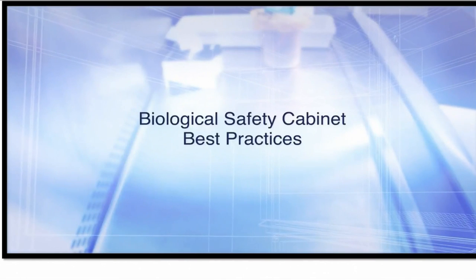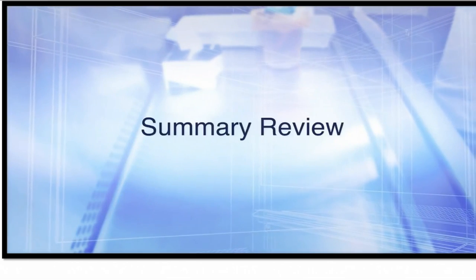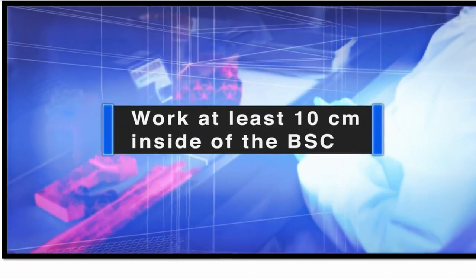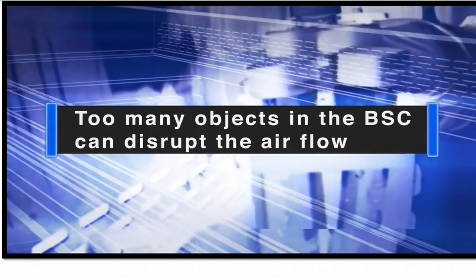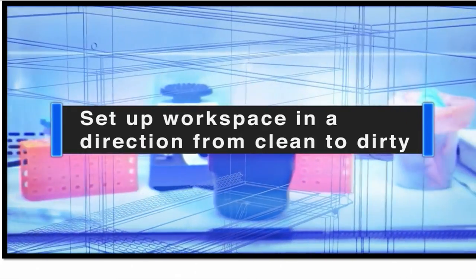In summary, there are a small number of best practices to follow in using a biological safety cabinet. Let's go over them one last time. Work at least 10 centimeters inside of the BSC. Do not block front and rear grills. Too many objects in the BSC can disrupt the airflow. Set up workspace in a direction from clean to dirty.